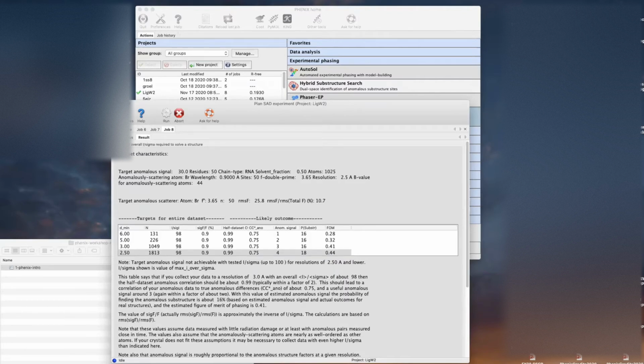Well, you have to collect very good data, I guess, is the simple answer. It means you have to do a very careful experiment. There are a lot of factors that go into that. The beamline needs to be set up properly. Beam shape. Radiation damage is going to be a problem, probably in many cases. And one of the things I'd recommend is really talking to the beamline scientists about how to collect a very accurate data set on their beamline.